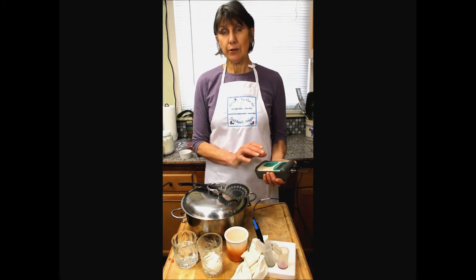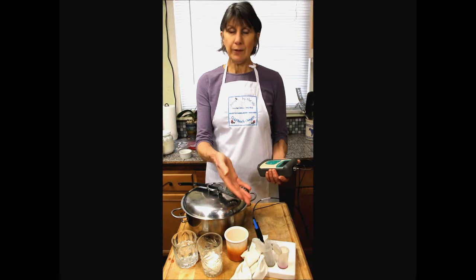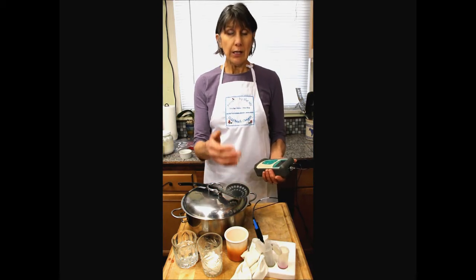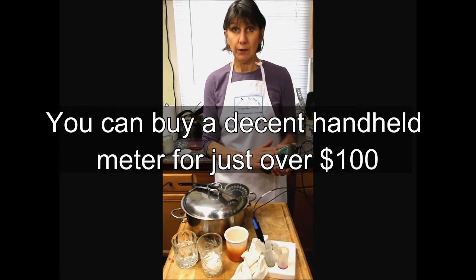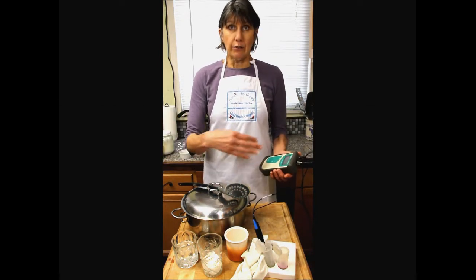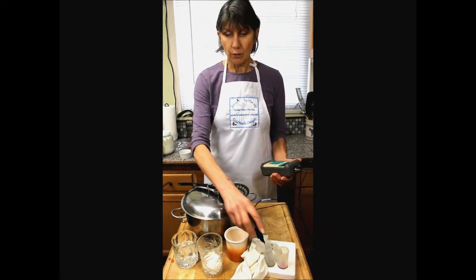Nelson Jameson is a particularly good company about helping you troubleshoot problems, because sometimes things go wonky with the electrode. These are very sensitive pieces of equipment. There's the electrode and then the meter itself. So they have to talk to each other and everything has to be just right. But that's why when they work well, they work well.